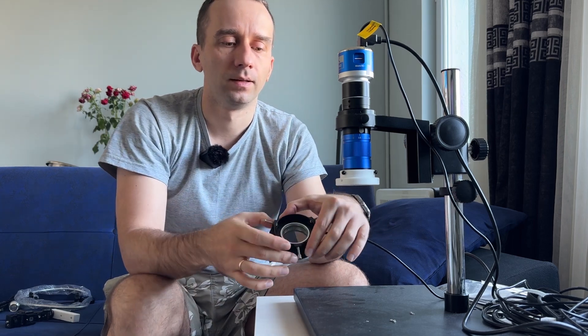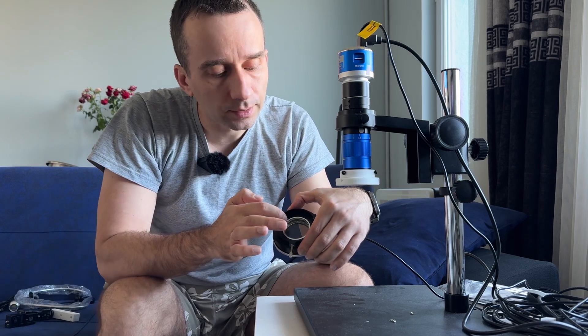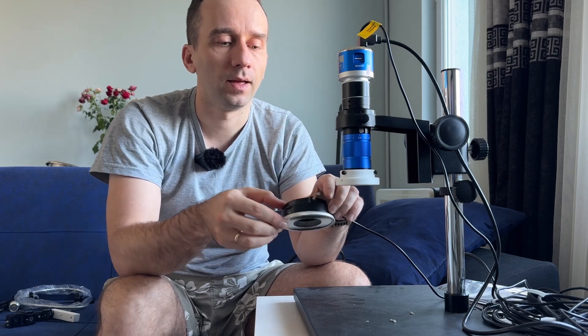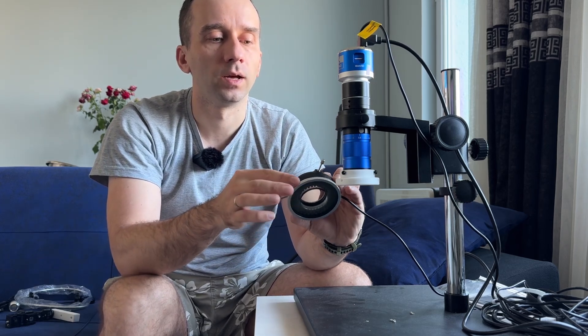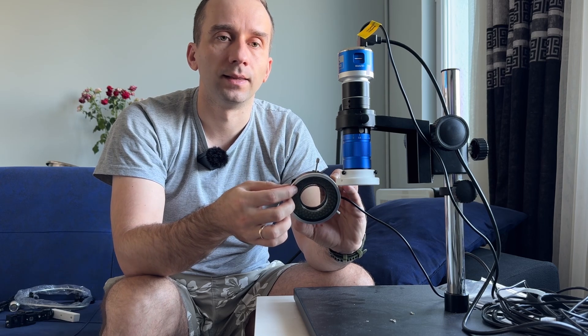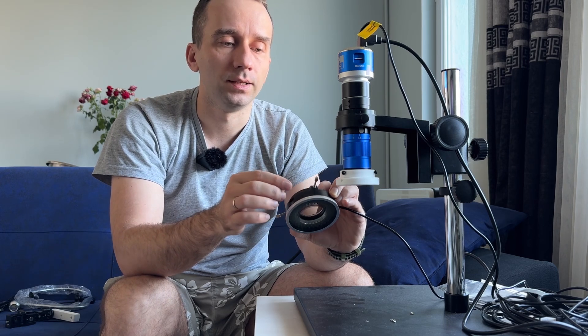It looks like here we see a polarized filter for microscope and we can rotate the polarized filter for LED light, but it's not too strong.